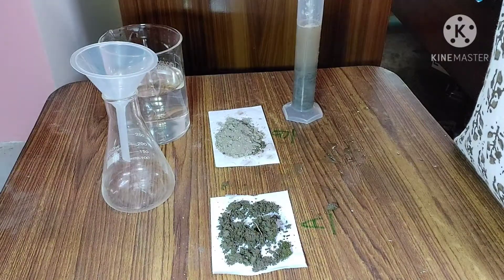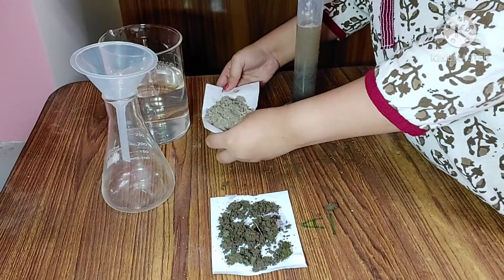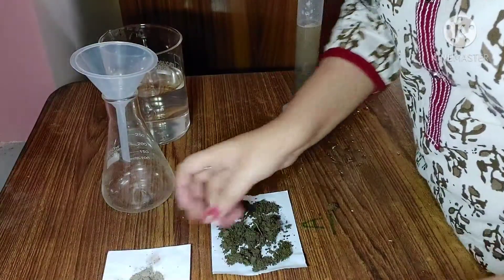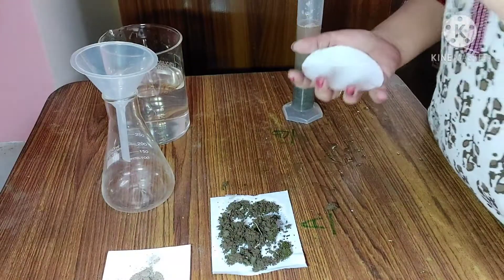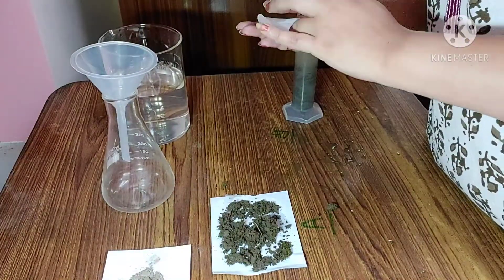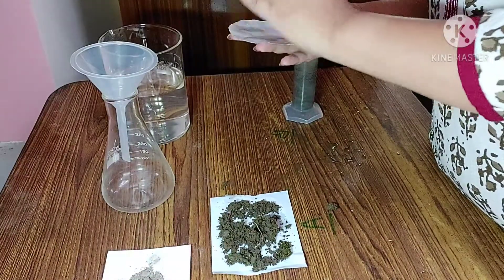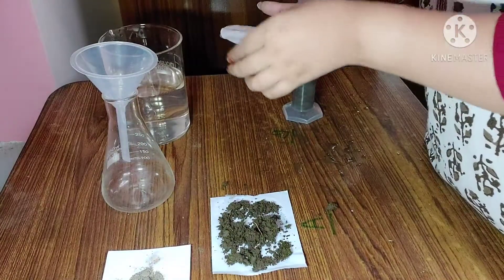Now I am going to show you how to measure the water holding capacity of soil. For this practical, first of all you will have to dry the soil sample using a hot air oven. Here I have already dried the soil sample. Another thing required is blotting paper — you will have to wet it with a little amount of water. This is necessary so that the blotting paper does not absorb water during the practical, which helps us get a proper result.